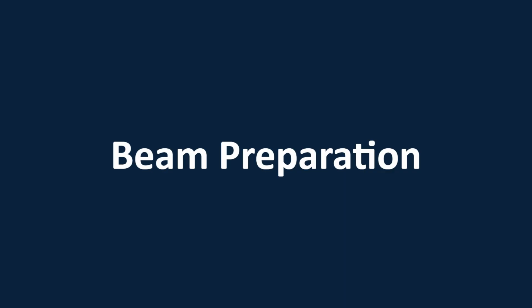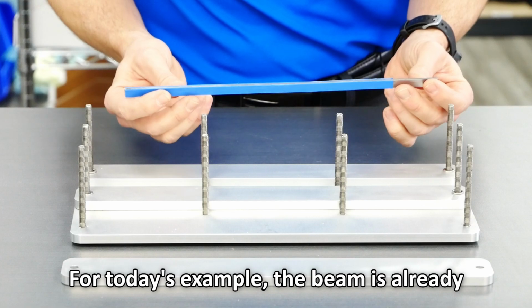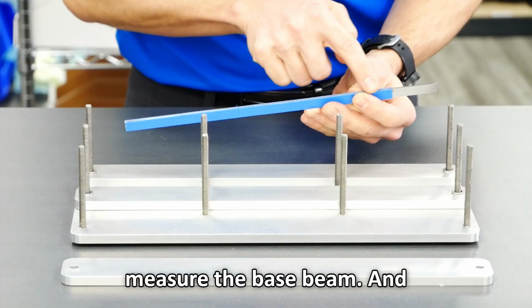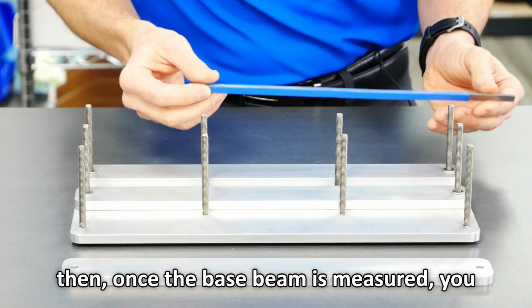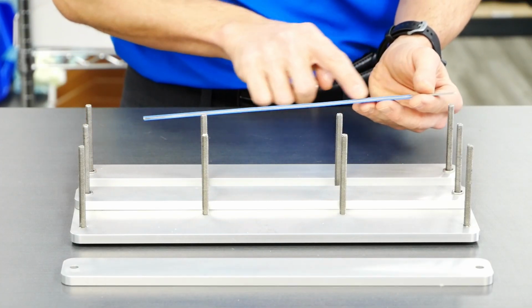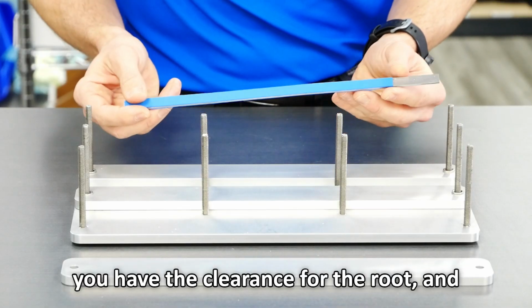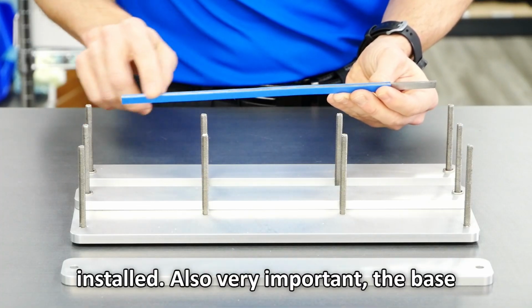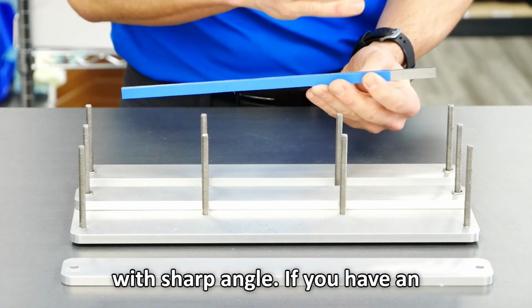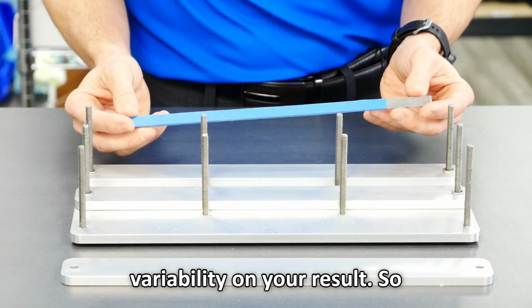For today's example, the beam is already prepared, but I will explain the process to you. First, you need to measure the base beam, and then once the base beam is measured, you install your viscoelastic material on the beam. You need to make sure that you have the clearance for the root and that your material is very well installed. Also very important, the base beam needs to be very well machined with sharp angles. If you have an irregular beam, it will create variability in your result.